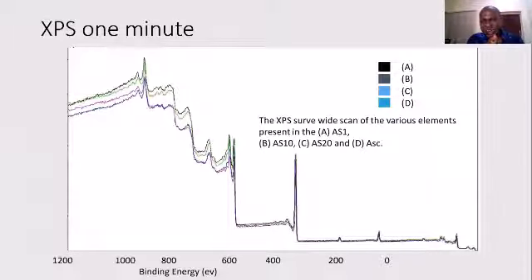that there is no variation using 1 minute, 10 minutes, 20 minutes, 1 hour, or what have you, to functionalize organometallic material or nanomaterial. And there, we concluded that the sonochemical method is an effective method that can permit us to modify the surface of nanomaterial in 1 minute. This shows that it saves energy, it saves time, and it's not laborious.